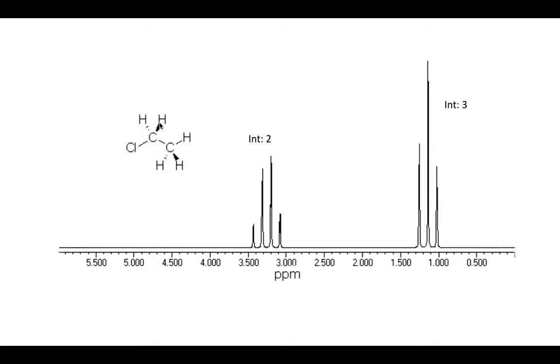And those neighbors could either both help, both hurt, or one help and one hurt, which is twice as likely. Which is why we see this peak right here from these hydrogens split into a triplet. It's got 2 neighbors and it's representing 3 hydrogens. Now we can see that those numbers don't correlate here because this is our integration of 2 further downfield. That's these hydrogens right here.